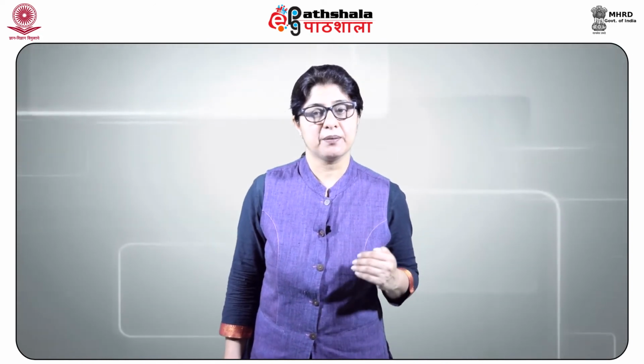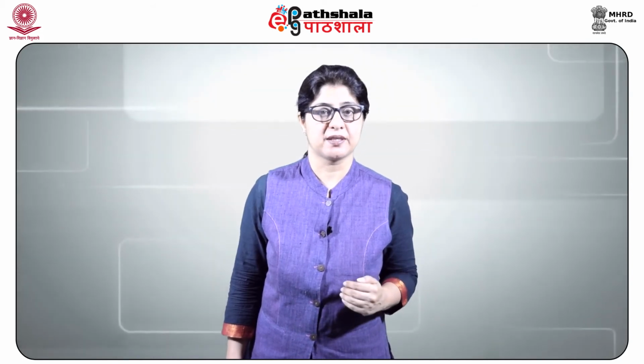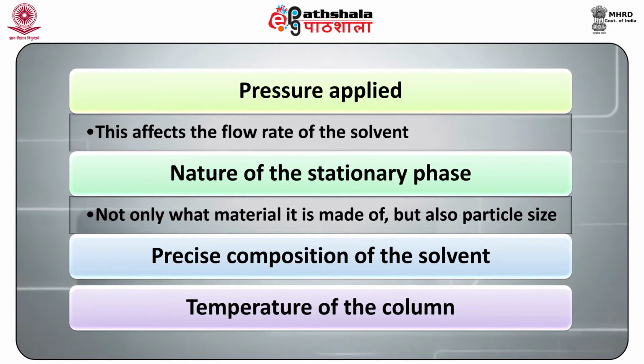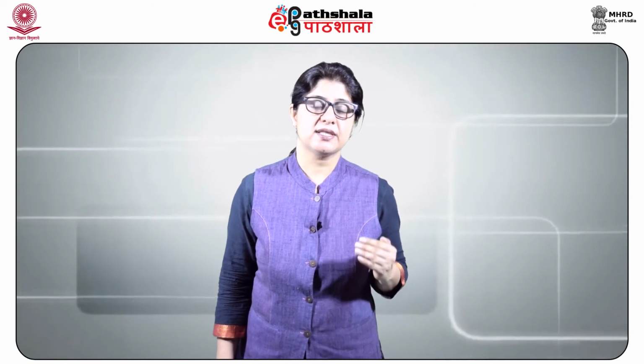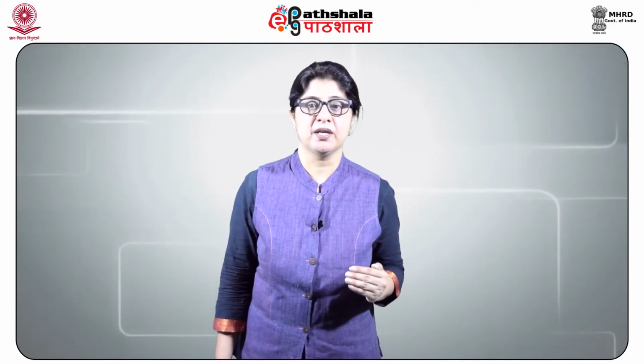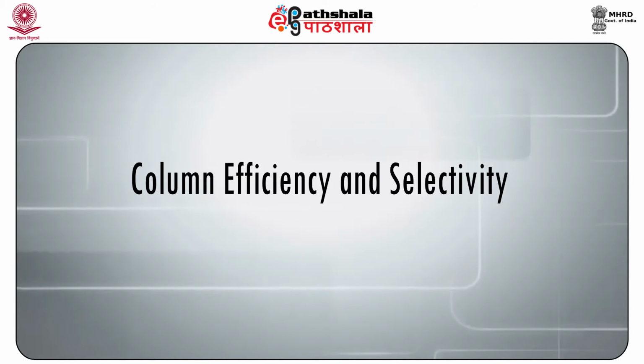For a particular compound, the retention time will vary depending on the following factors: pressure applied, this affects the flow rate of the solvent; nature of the stationary phase, not only what material it is made of but also the particle size; precise composition of the solvent; temperature of the column. This means that these conditions have to be vigilantly restricted if using retention time is the method of identifying the compounds.